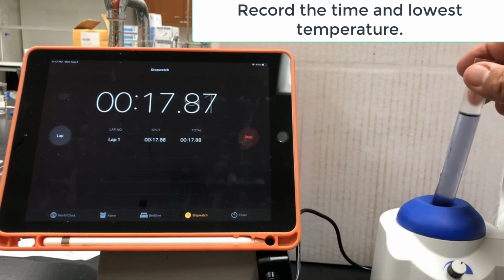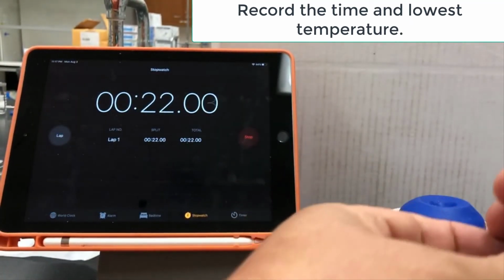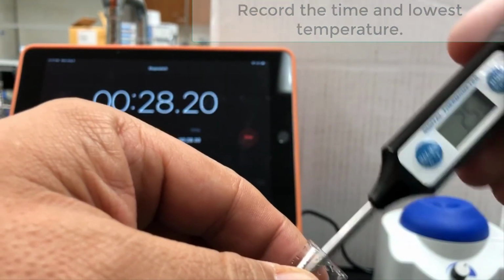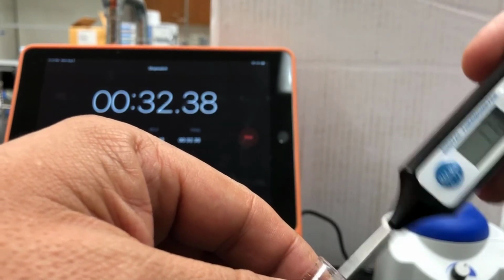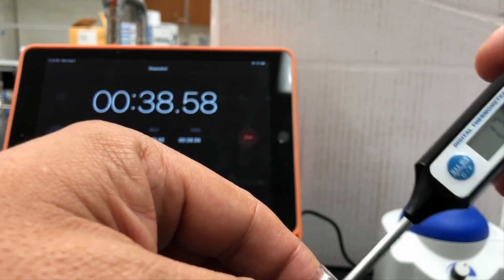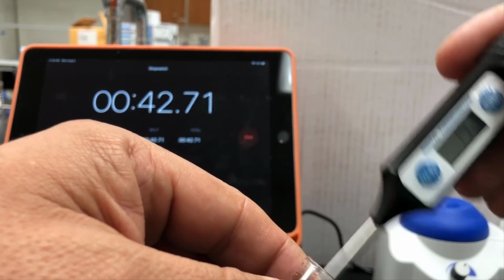We have a color change, and we'll throw the thermometer in real quick and be able to get a fairly accurate temperature, I think, from this one. Again, lowest observed temperature. So it looks like about 1.7 degrees Celsius is what it dropped to.